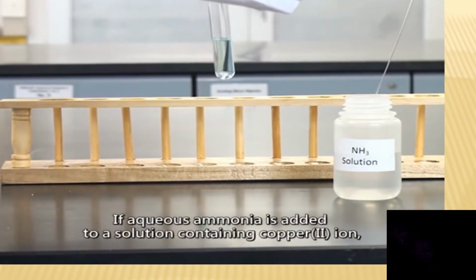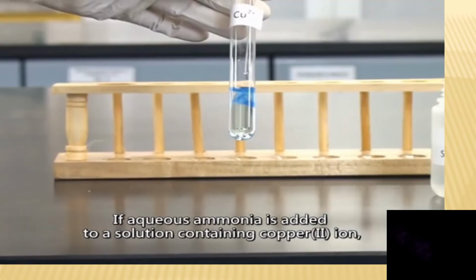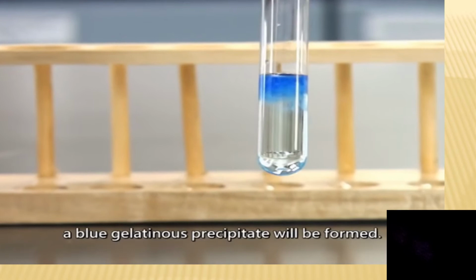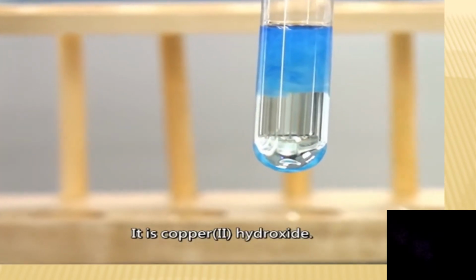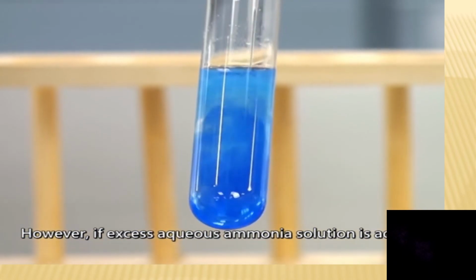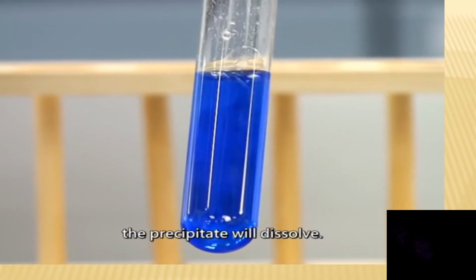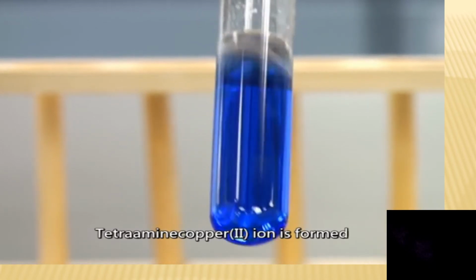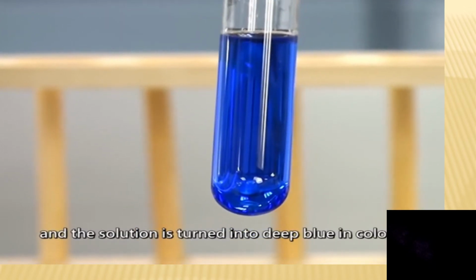If aqueous ammonia solution is added to a solution containing copper 2 ion, a blue gelatinous precipitate will be formed. It is copper 2 hydroxide. However, if excess aqueous ammonia solution is added, the precipitate will dissolve. Tetraamine copper 2 ion is formed and the solution is turned into deep blue in color.